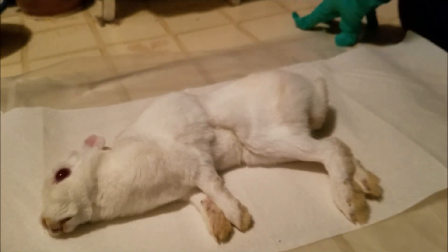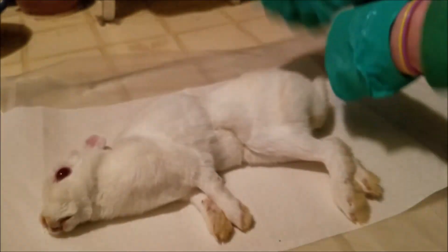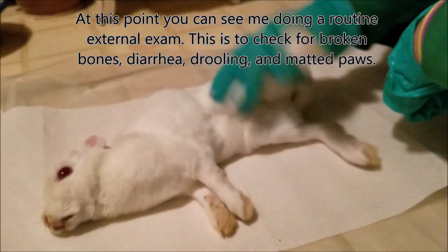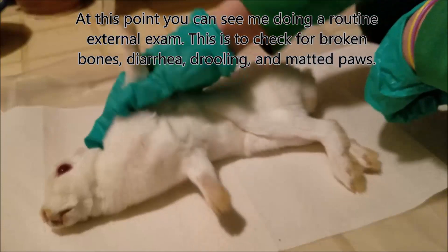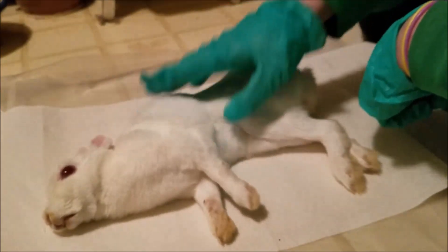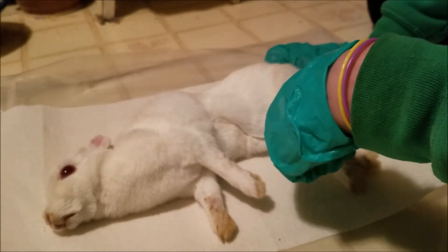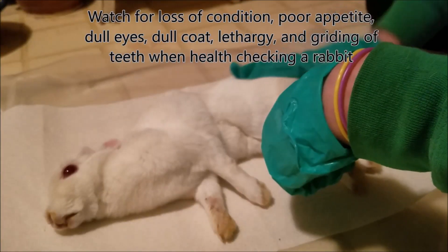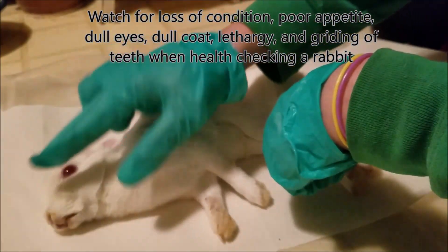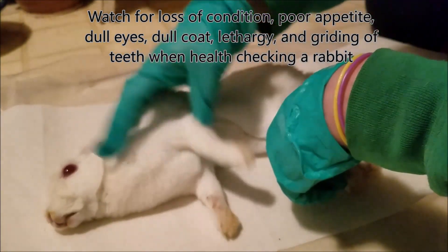Hey guys, today we're going to be learning about how to necropsy your own rabbit. This is a doe that just passed away. Her name is Amelia. She's a Britannia Petite Ruby Eyed White senior doe. I did notice that she had started wasting away over the past few days and her diet was reduced, so she was still eating. It's important to note the behavior of rabbits before you lose them. She just wasn't quite acting herself. Her eyes looked very dull, she didn't look very healthy, and the inside corners of her eyes had a little bit of eye boogers.